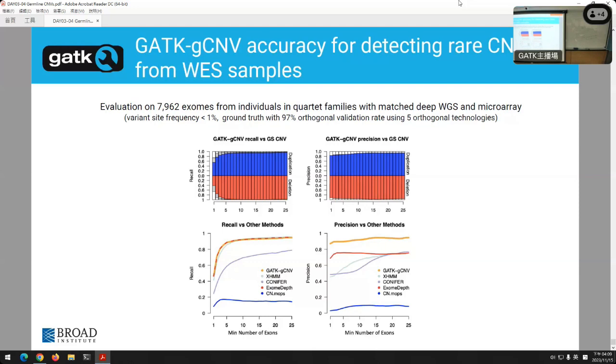In terms of sequencing depth, for whole genomes we typically use around 30x. For whole exomes, around 80x. At least that's what we commonly do in humans at the Broad. I actually don't know off the top of my head if they've tested the impact of different depths.